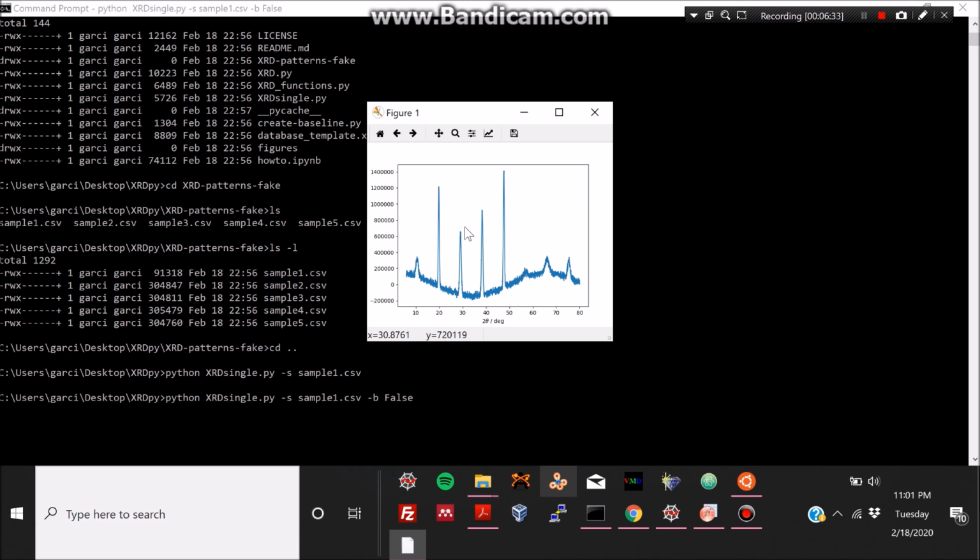Okay, so what are we gonna do now? I guess I'll show you now how to calculate that crystallite size from an XRD peak in this XRD pattern. We should probably take the highest peak in this example, just because it may be the most resolved.